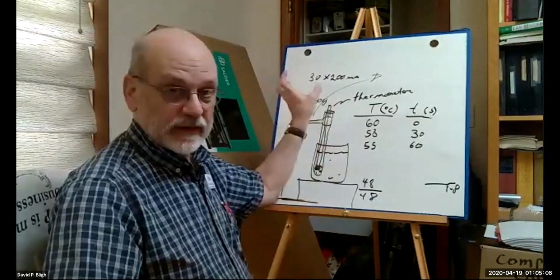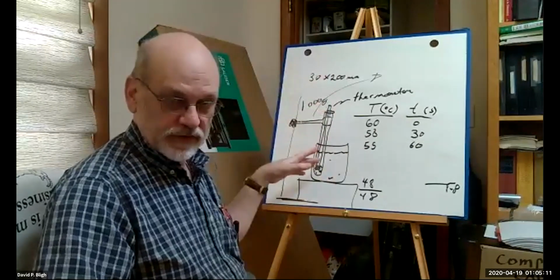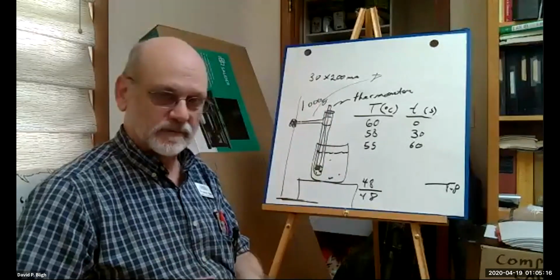You put your powder funnel in there, add the material, and keep it stirred up and submerged in the water bath until it's all melted and mixed together really nice. So you have a solution, a homogeneous mixture.